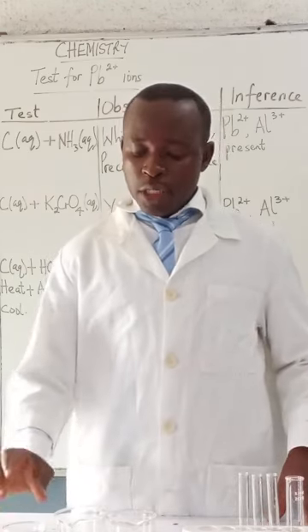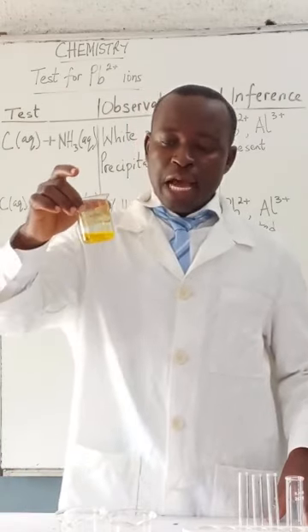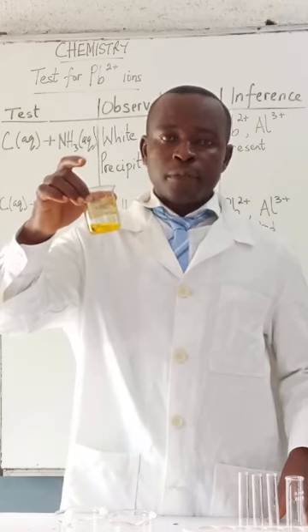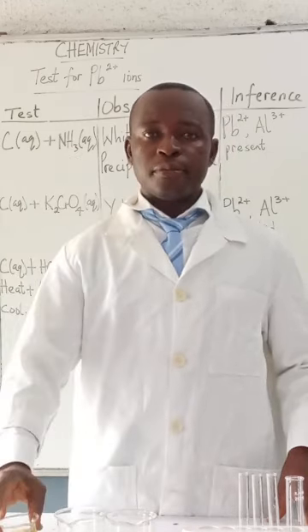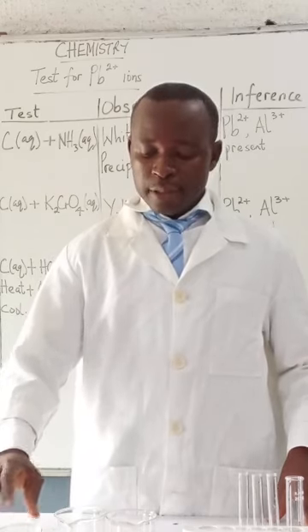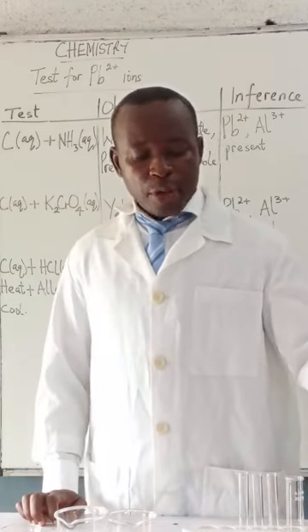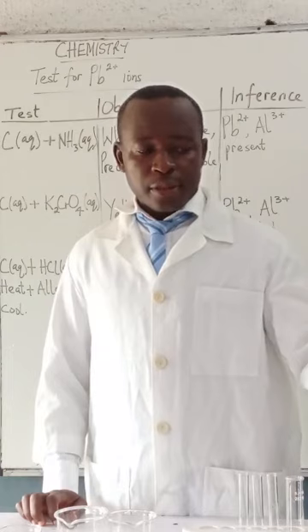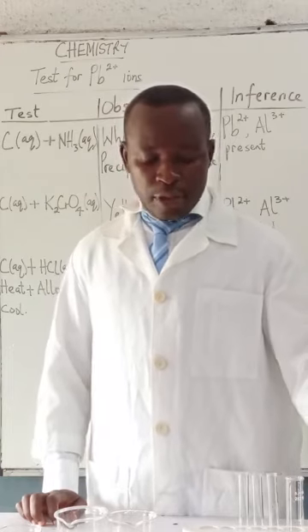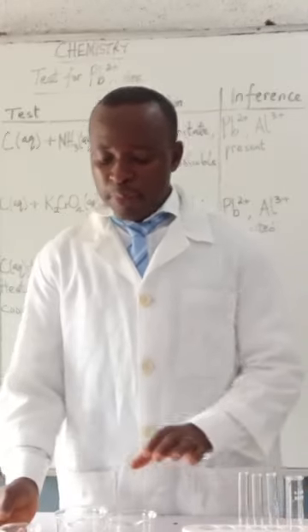And we need basically a reagent like this. This reagent here that has a yellow color is potassium tetraoxochromate 6. That's the major reagent we need. We also need this reagent, aqueous ammonia, that is ammonium hydroxide.